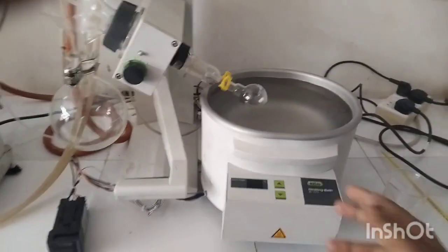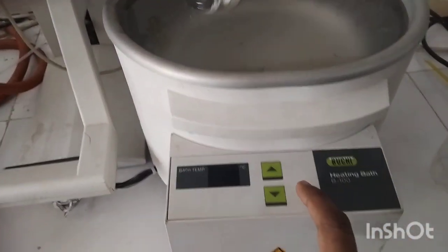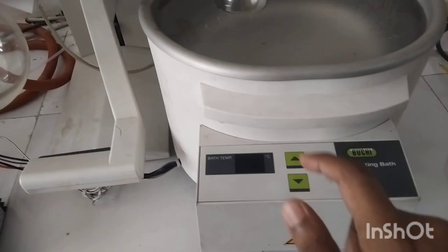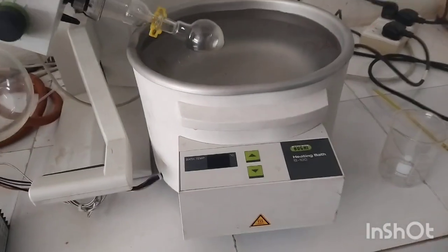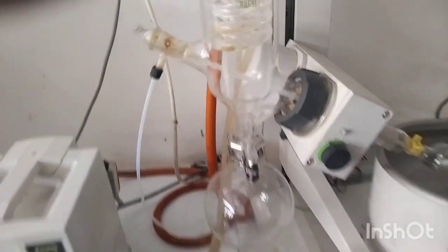So that's it. And the next one, if you'd like to increase the temperature, then you can use this specific button, the upper arrow, and there is a lower arrow. When you use this upper arrow, then the temperature will be increased. When you use the lower arrow, then the temperature will be decreased. So guys, you have to be concerned. And the next one, you have to check it out.